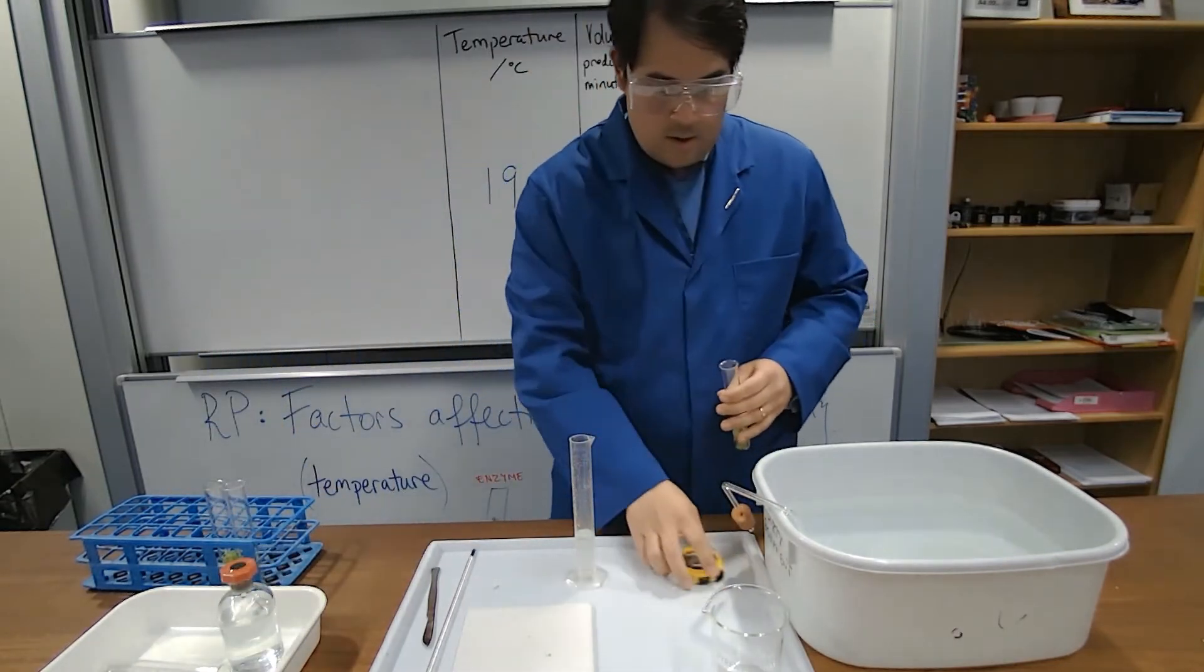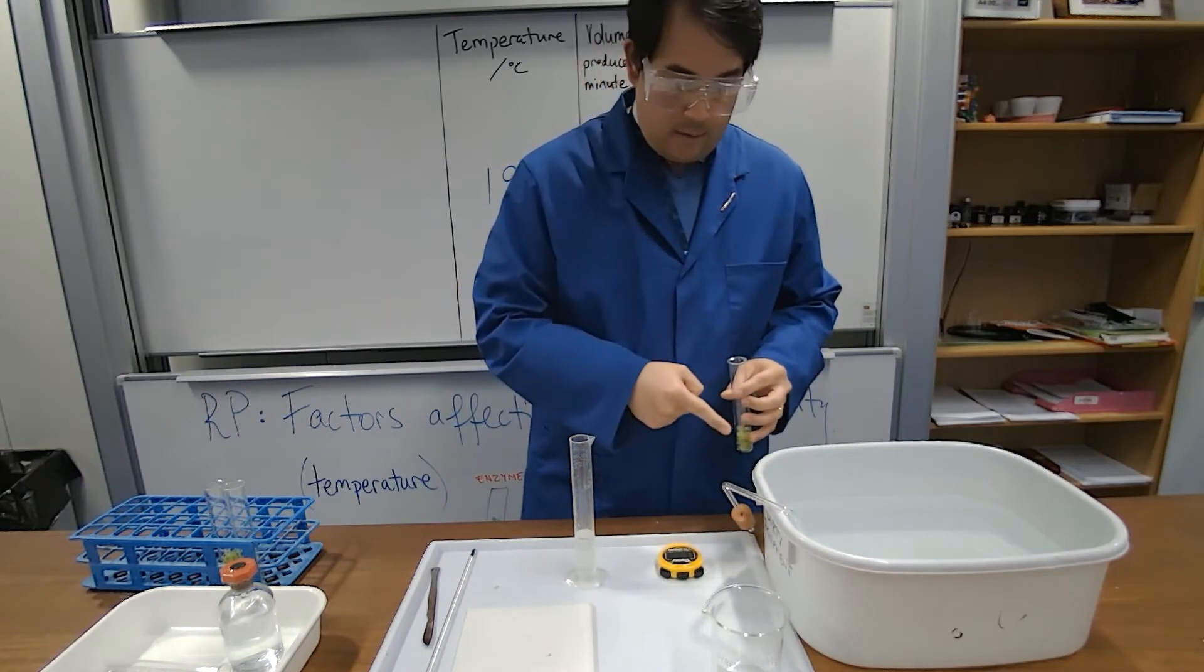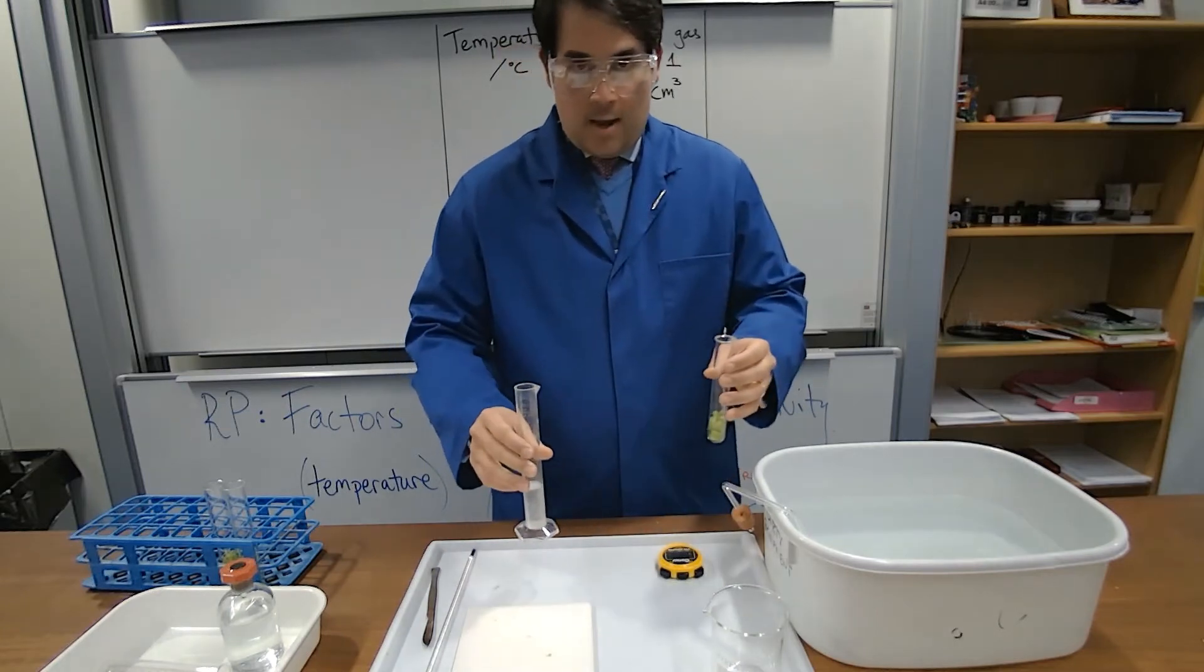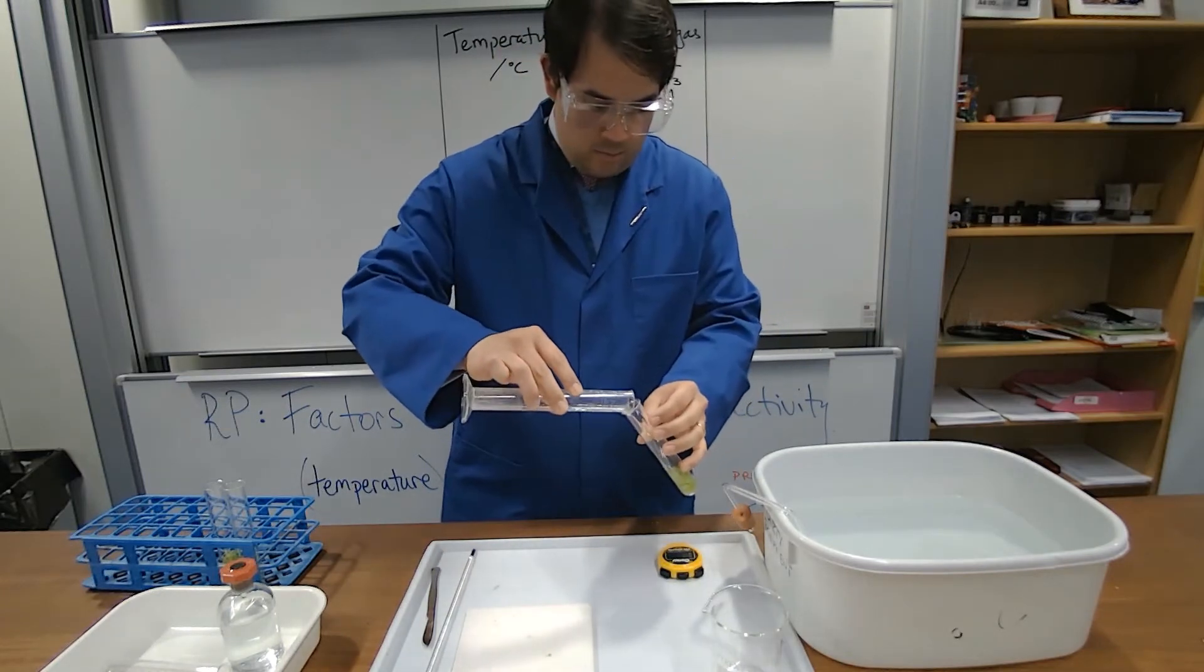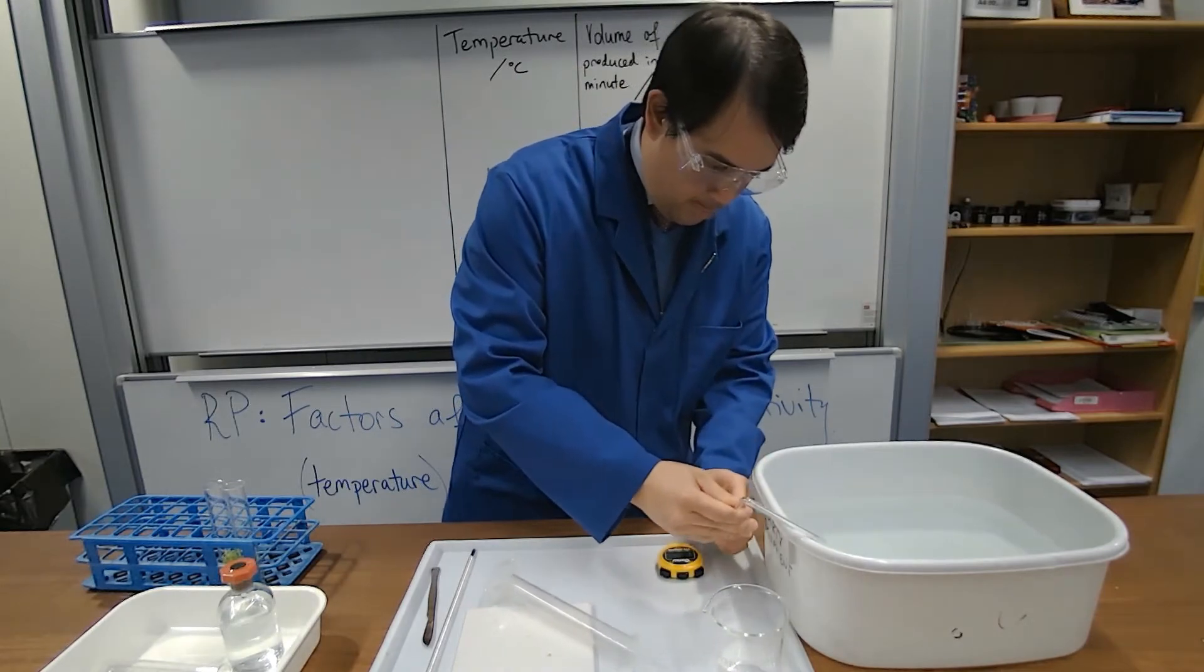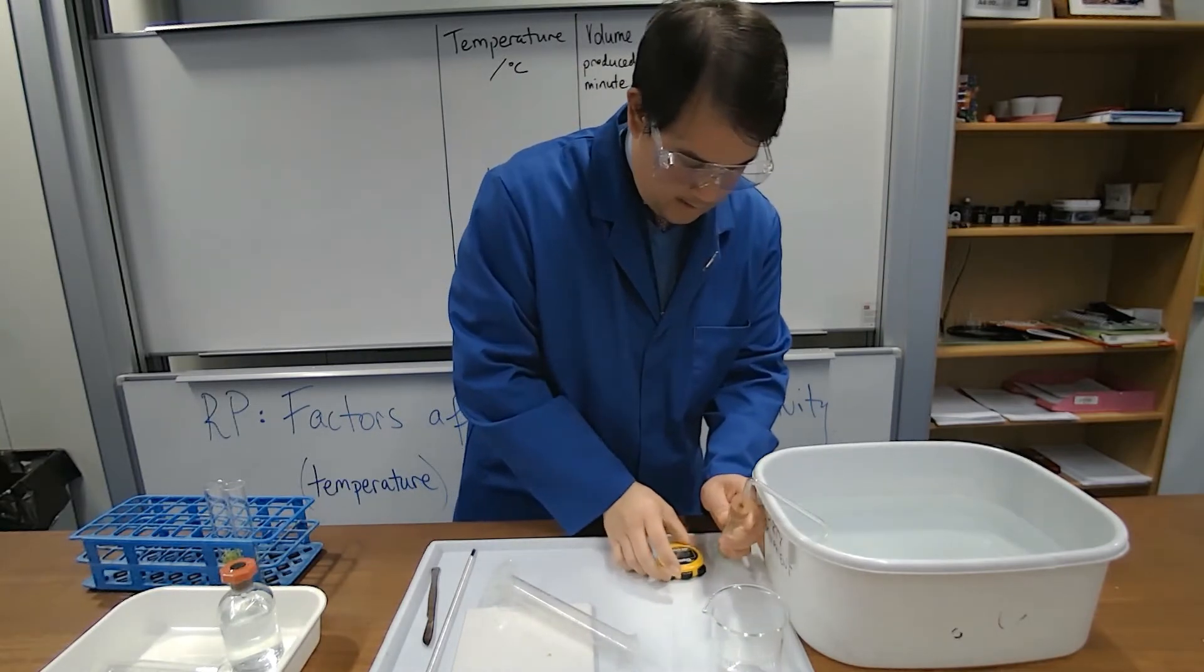So, the moment I get that, put that on, straight on, start with the stopwatch. Ready? Set it, and go. Stopwatch. And time.